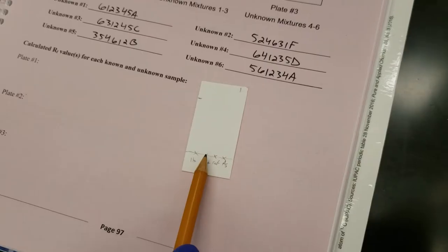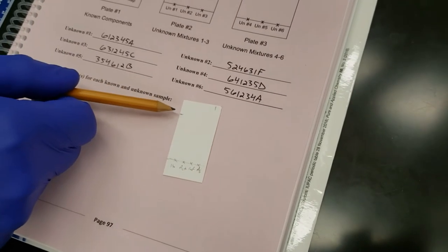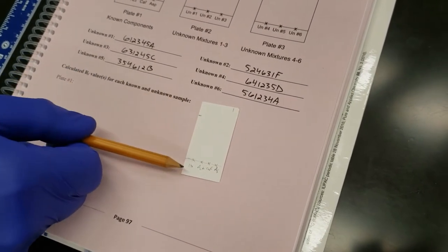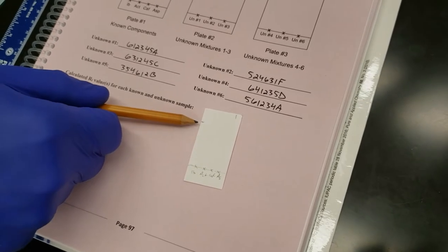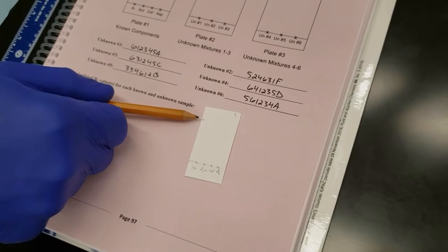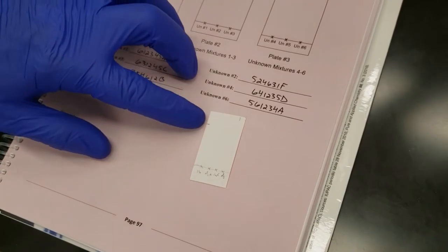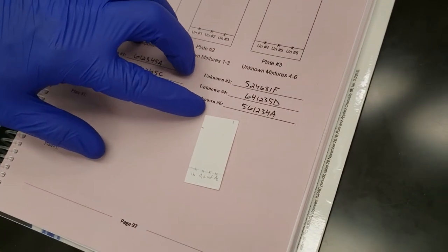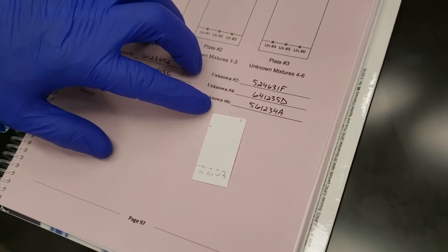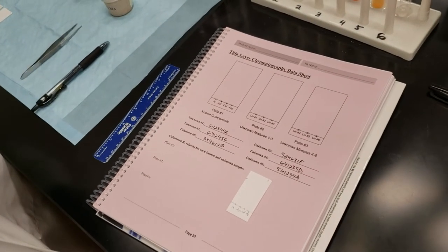So these X's are the positions where we're going to spot our sample solutions. I've also made a small mark here at the top of the plate, which indicates where our solvent front line is. When our solvent moves up our silica gel plate, we're going to pull it out of the developing chamber once the solvent line reaches this 1 centimeter mark. That puts us 1 centimeter from the top of the plate. We cannot let our solvent system run all the way to the top of the plate, otherwise it negates any findings or any data that we would get from this experiment. So the next thing we need to do is spot our known components.